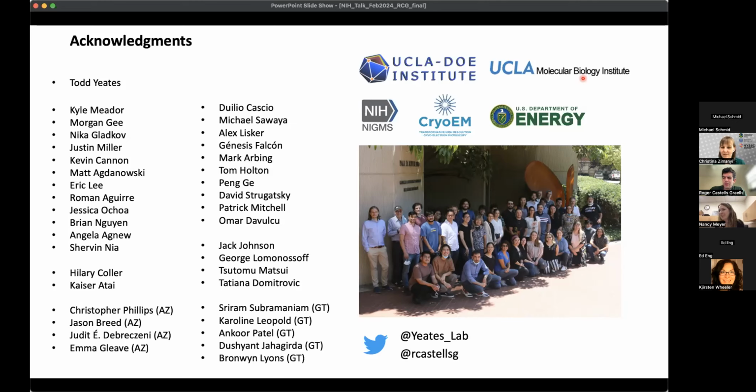Yes, we used 3D classification without alignments. For the parameters, it's because it has been a while and we tried lots of things. I cannot think of any specific one. I just say that we tried multiple classes. One of the things was the masking. As I say, we started with the default parameters and then we tried multiple things.